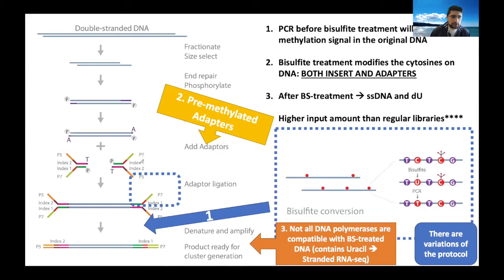So this is just a regular library preparation. However, the adapters that we're adding here are slightly different from the adapters that we saw yesterday. Not in the sequence itself. The sequence is exactly the same. They still have to go on an Illumina machine.